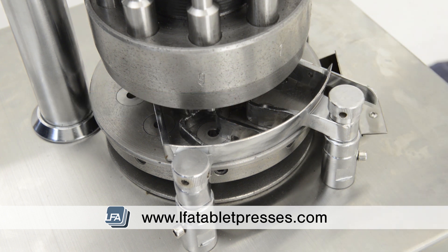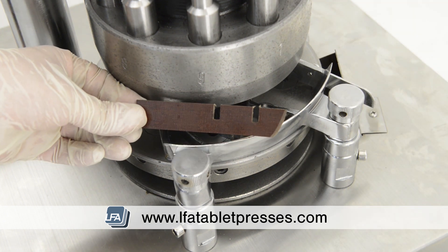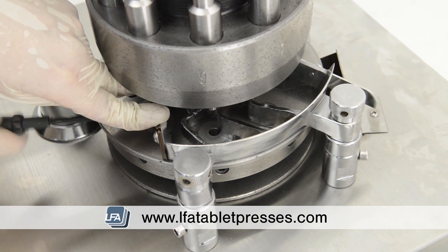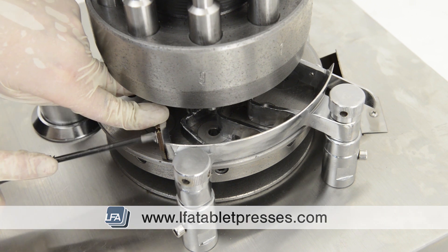Now replace the scraper blade. This scrapes excess powder off the die face. Whilst installing it with the two screws, press down the scraper blade against the turret table firmly to ensure it's tight.